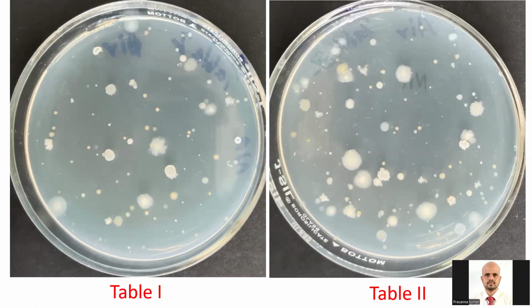We tried to study the unique morphotypes suspended in the air. We identified this unique morphotype in green color here in table one. There are 4 tables, and we used 2 tables. We opened the plate and left it open for 20 minutes. These are some EPS producing colonies which are not there in table 1, and this swarming colony is not there in table 2. So this shows there is a heterogeneous distribution of bacteria in the air.